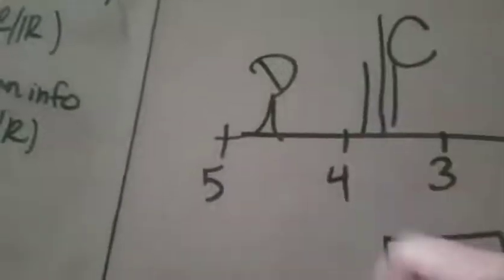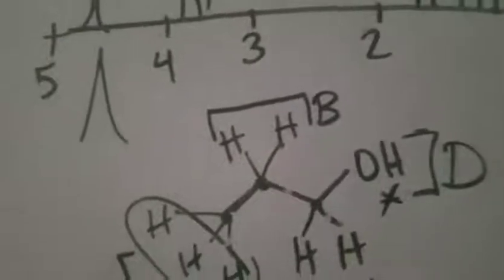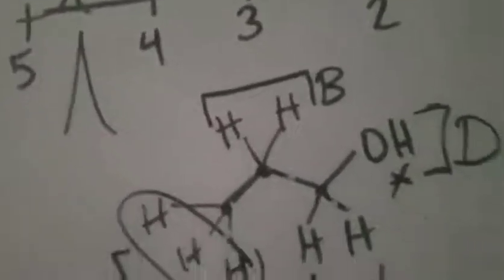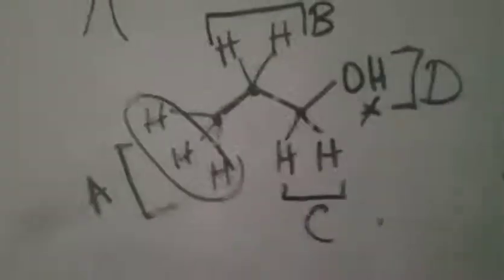Alcohols are characteristic of having a single peak and a little bit more downfield. So if you don't see that broad singlet like this, or maybe like this, that means your alcohol is not there. That's okay. Just don't label it or just put alcohol not there. I'll know if it's supposed to be there or not. I just don't want you guys to get tripped up and get confused. So this was a very, very simple example.